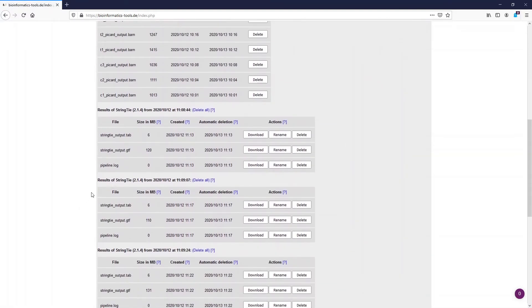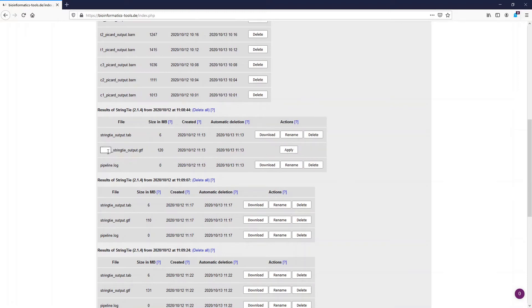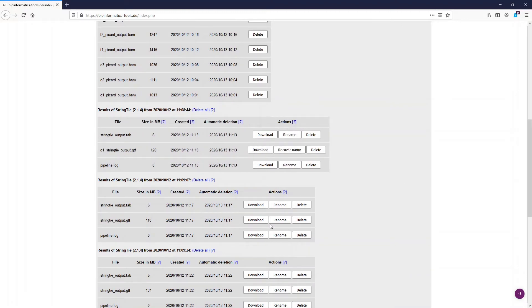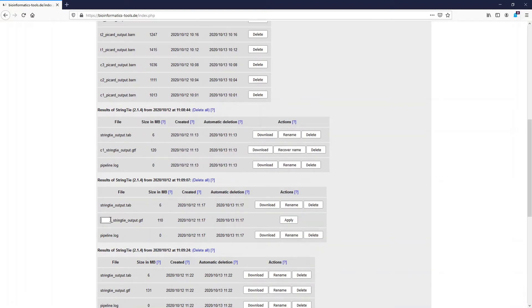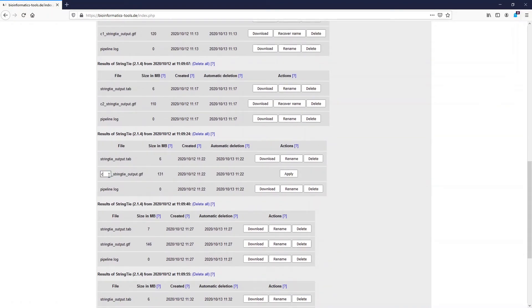As we run StringTie six times we got six new reference files. It is now necessary to merge them to get a unique reference representing all the samples. We can do that with the program StringTie merge. In order to do that we have to rename all the reference files because each StringTie run created a file with the same output name.